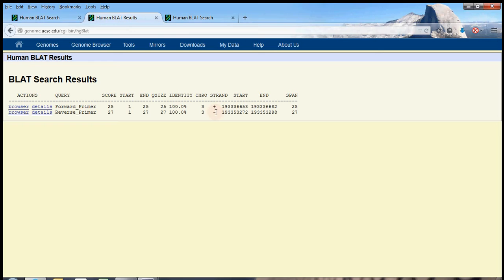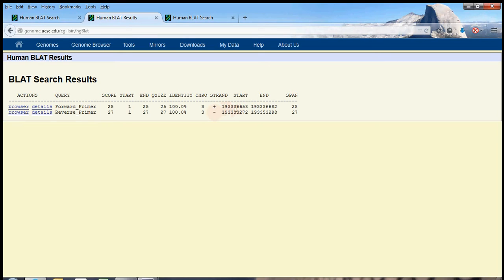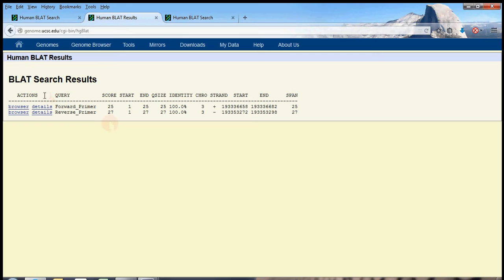the forward primer and reverse primer correspond to opposite strands of the human genome. And if you're ever designing primers, that's really important, otherwise you will not get amplification. So we know that the primers map to reasonably close places, because these coordinates are awfully close, at least up to the 10,000th place.